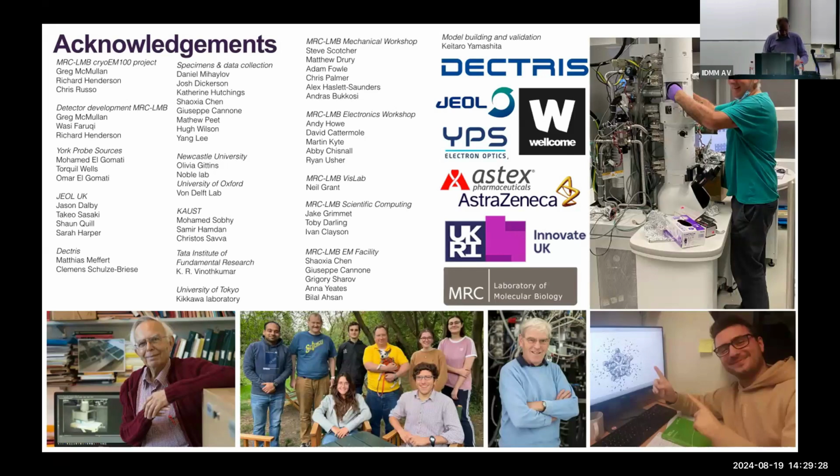So when I spoke to Richard Henderson about this project, he said one of the things that could make it possible is that the software could compensate for aberrations that get included by having a really cheap microscope. Could you maybe just talk about whether that's actually been the case, because this was a very long time ago, or whether those aberrations have not actually been a problem?